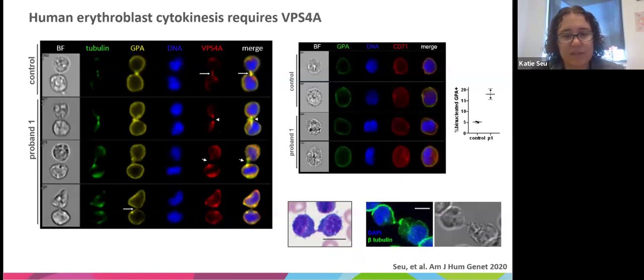So theoretically, when these eventually coalesce back together, if they don't rupture or break spontaneously on their own, they're going to generate a binucleated cell, which is likely why our patients had increased binucleated cells, and we were able to quantify these in our cultures as well using the ImageStream analysis.